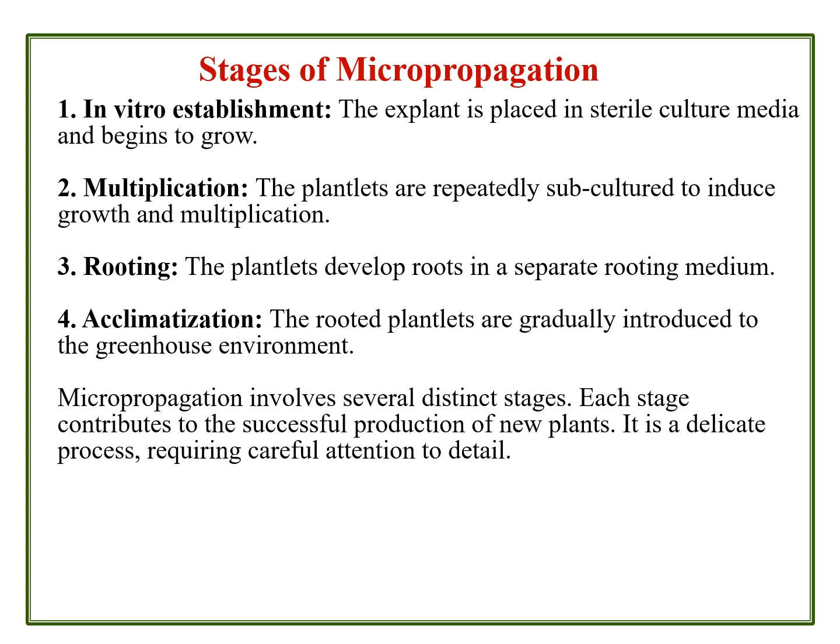Of course, we know very well about the main principle behind the autoclave. That is, the boiling point of the water generates the water vapor that hits the surfaces of the culture material, and the culture media also gets sterilized. Of course, in previous chapters we discussed in detail about the autoclaving of culture materials and media.